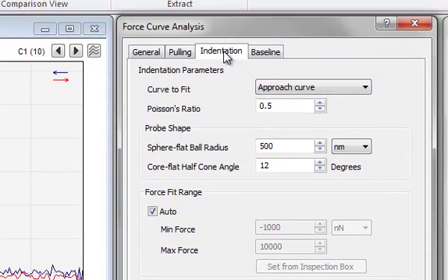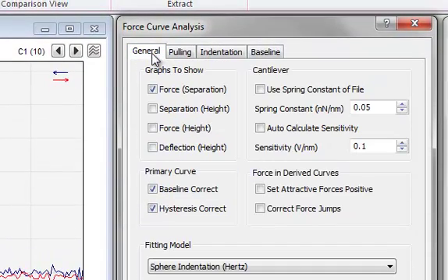Please also verify that the settings on the General tab correspond to those shown here.